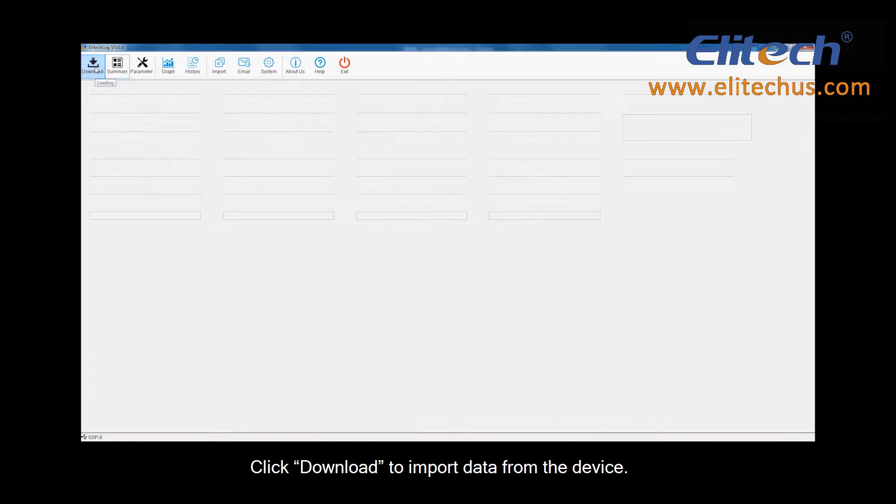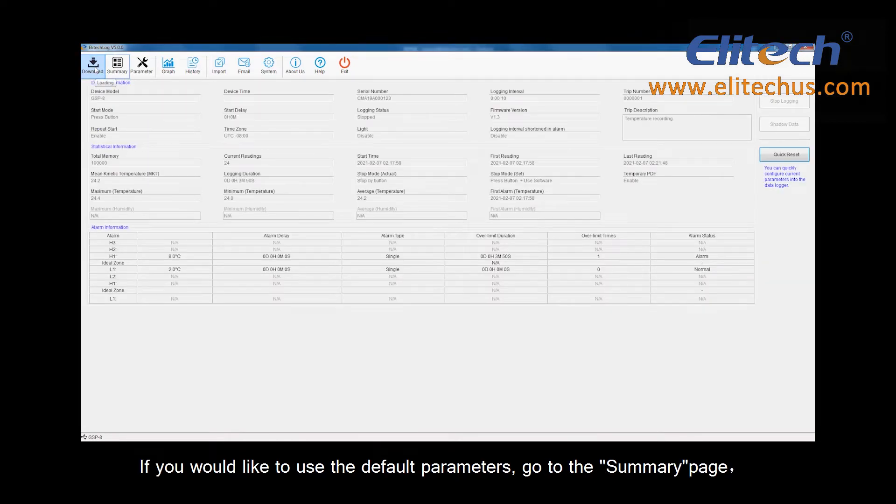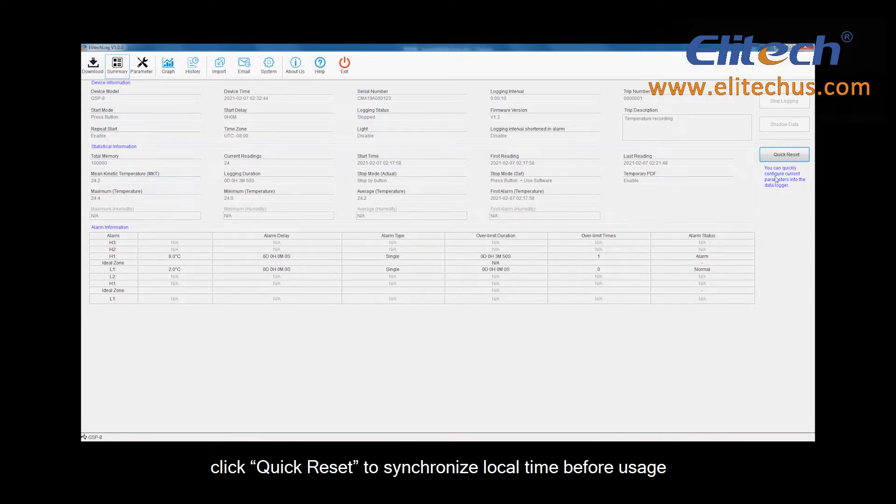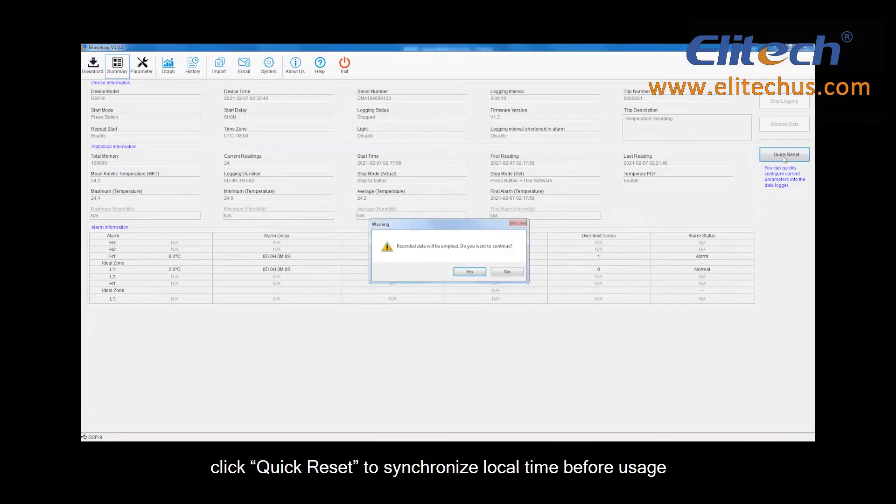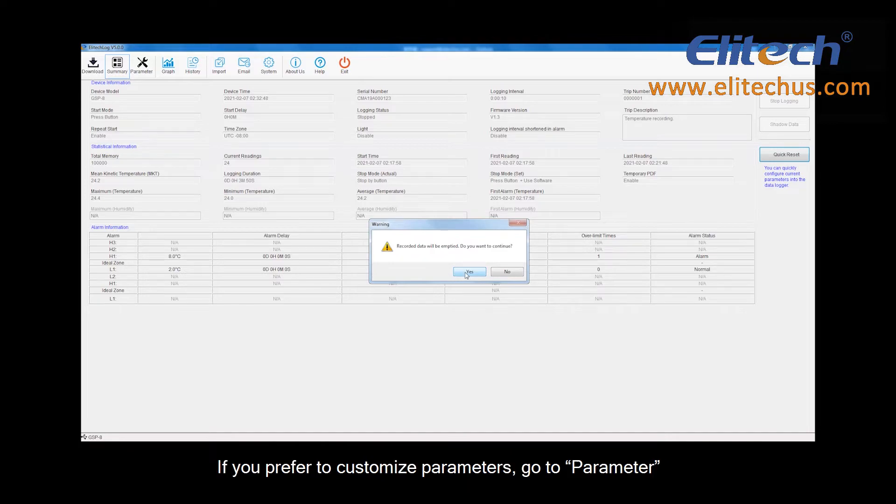If you would like to use the default parameters, go to the Summary page. Click Quick Reset to synchronize local time before usage.